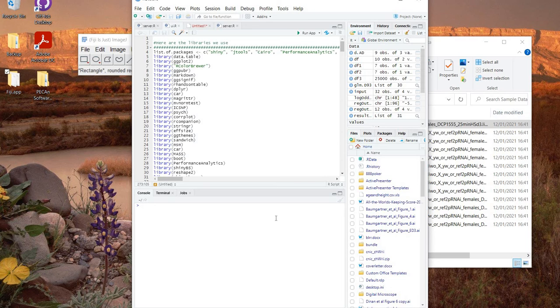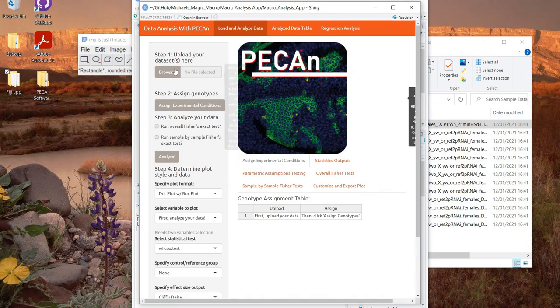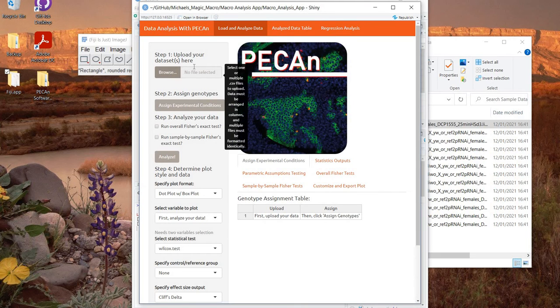In this example, I'm going to run it locally using RStudio. What you do is just open up the server and UI file and click this button here in the top right corner. It says Run App, and it's just going to launch it, and it's going to work pretty much exactly the same as if you used a web browser. So let's do something a bit fancy.